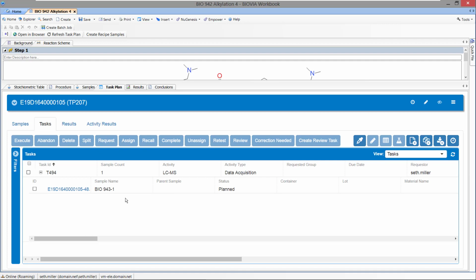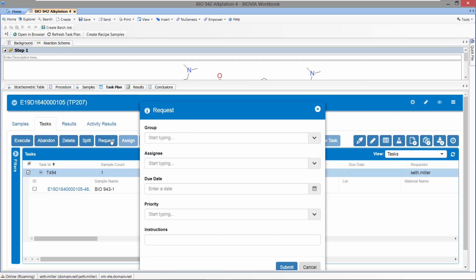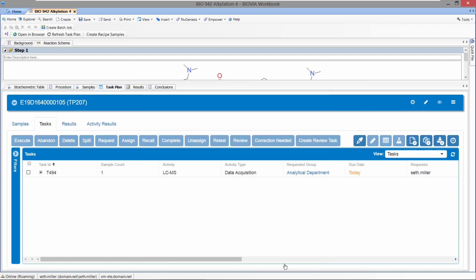I now want to request this analysis of the analytical department. That request has now been sent to the analytical department, and I can now continue with the rest of my work while awaiting my results.